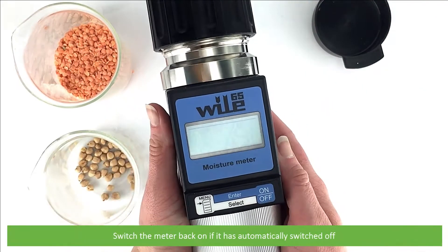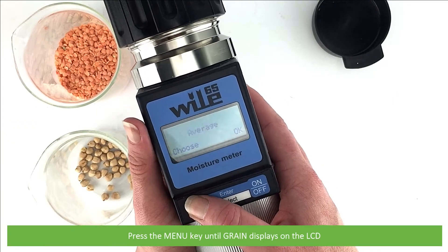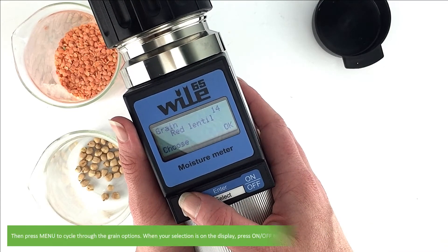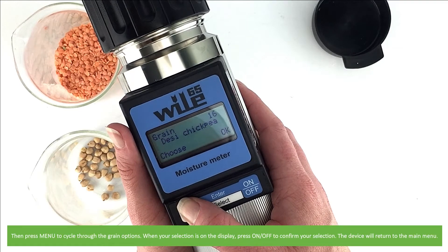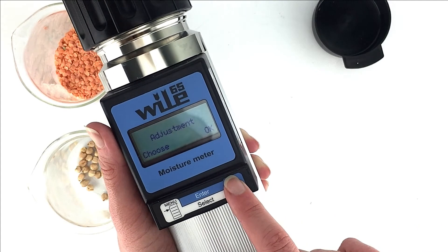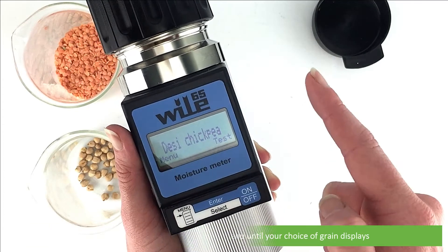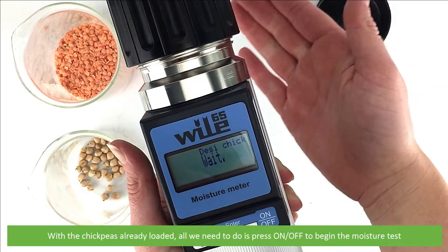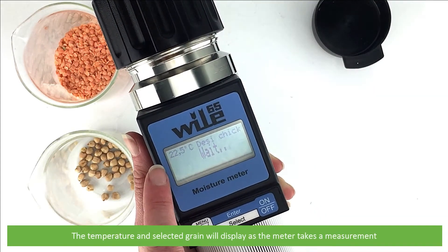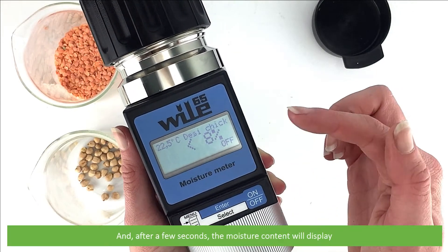Switch the meter on if it has automatically switched off. Then press the menu key until grain displays on the LCD. Press on/off to enter into the grain selection submenu, then press menu to cycle through the grain options. When your selection is on the display, press on/off to confirm. The device will return to the main menu. Then press the menu key again to cycle through the main menu until your choice of grain displays. With our chickpeas already loaded, press on/off to begin a moisture test. The temperature and selected grain will display as the meter takes a measurement, and after a few seconds the moisture content will display.